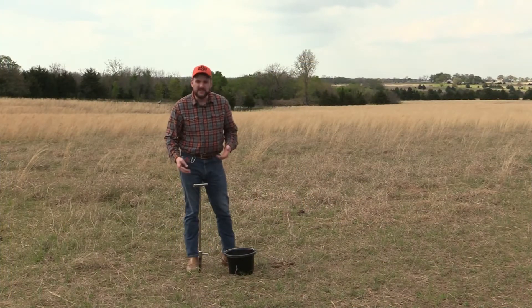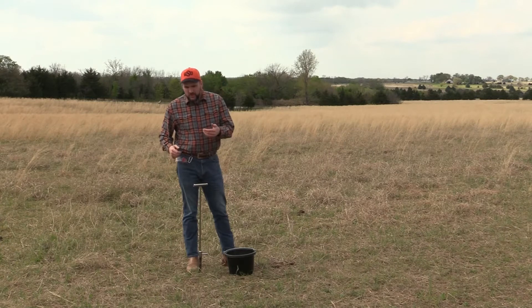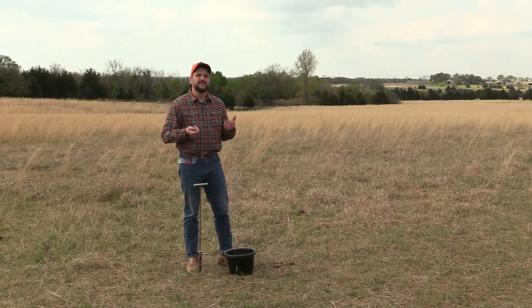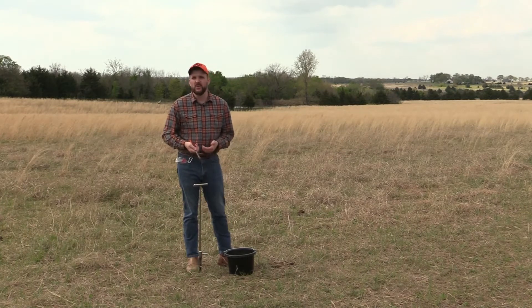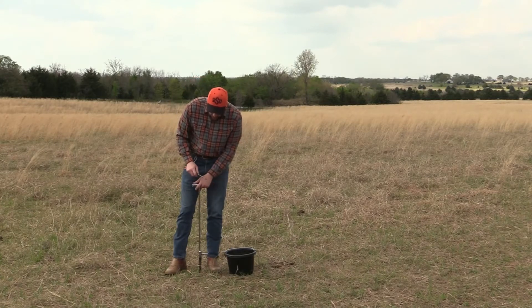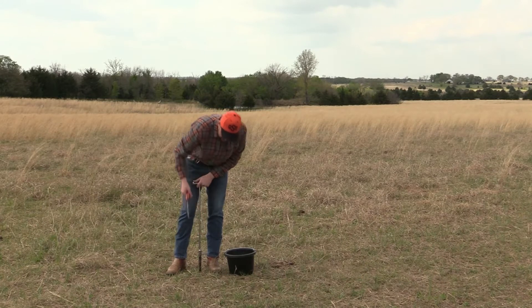One of the most common things that OSU Extension is known for is soil testing. There are a lot of reasons we soil test, but this video is simply to show you how to take a good, proper, representative soil test of what is out on your property. We have a tool here called a soil probe — it takes cores, and that's what this tube is right here.